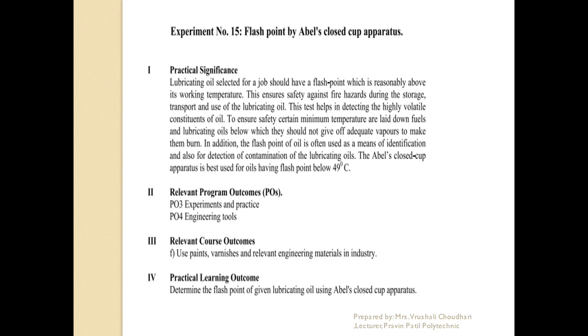Before starting the experiment, do you remember experiment number 14? In that we used the open cup apparatus, and here we are using a closed cup apparatus. This apparatus is used for highly volatile liquids, such as lubricating oils or fuels which easily catch fire at low temperature. For that we are using a closed cup apparatus for safety purposes.